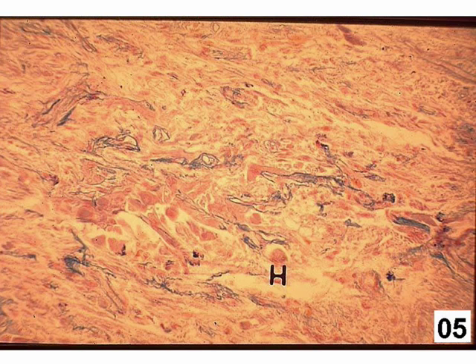In the next slide, which is now a medium magnification, we can begin to see a little bit of structure in the pars nervosa. These spaces, or lumens, are blood vessels, capillaries, that run in the pars nervosa.